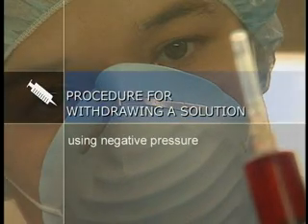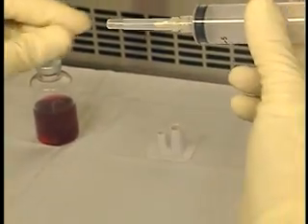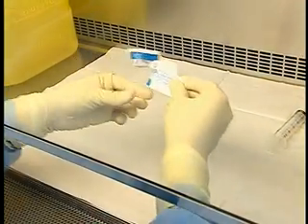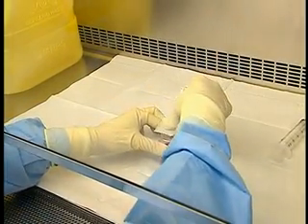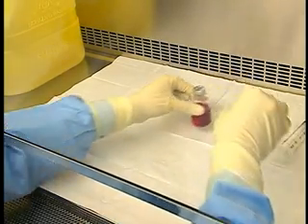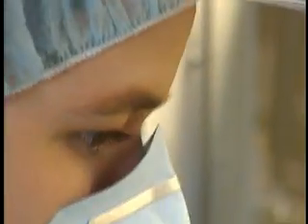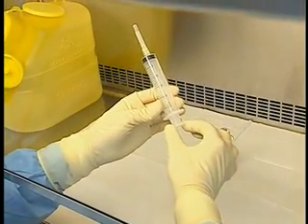Procedure for withdrawing a solution using negative pressure. Check that the bevel is properly aligned with the graduation to facilitate volume reading during the withdrawal from the vial. Start by disinfecting the rubber stopper of the vial with an alcohol swab. In our example, we will withdraw 10 milliliters of solution. Hold the syringe in a vertical position and draw in a volume of air equal to the volume to be withdrawn from the vial.